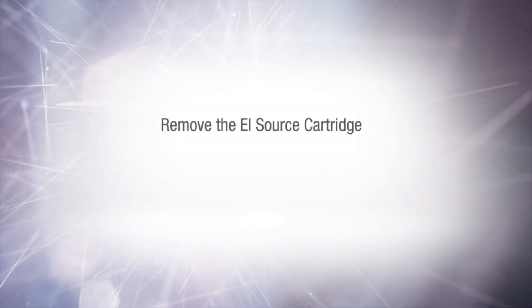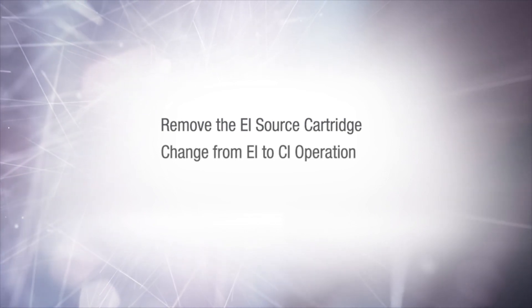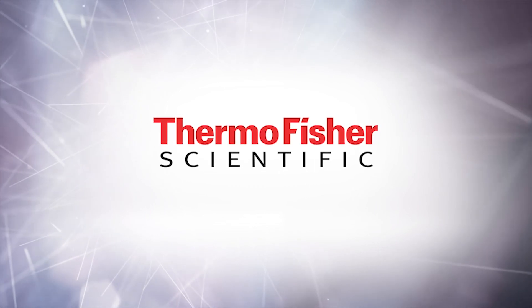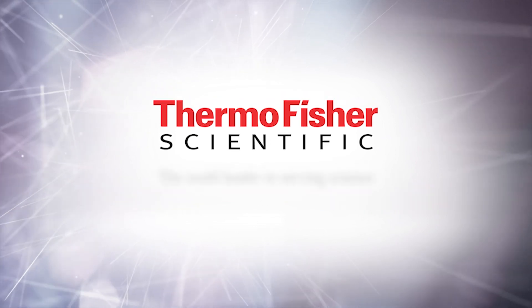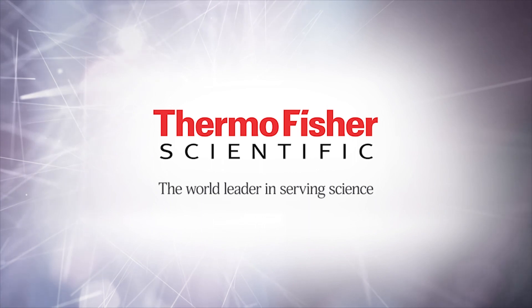You should now be able to remove the EI source cartridge, change the source configuration from EI to CI operation, and reinstall the CI source cartridge.